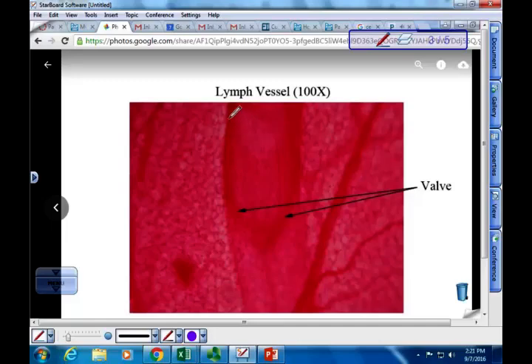You're seeing the lymphatic vessel in longitudinal section as opposed to cross section like we saw for the cardiovascular vessels. So that makes it a little bit easier, right? In fact, in our slides, I don't think we have this surrounding adipose tissue and extraneous tissue out here. It's just a channel like we see there. So you need to recognize that this is a longitudinal section of a lymphatic vessel, or basically recognize that it's a lymphatic vessel. We're not doing layers to its wall or anything like that.